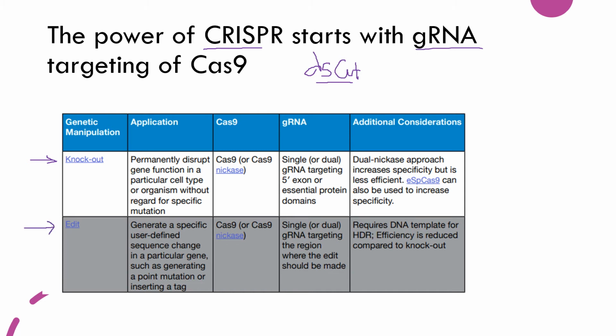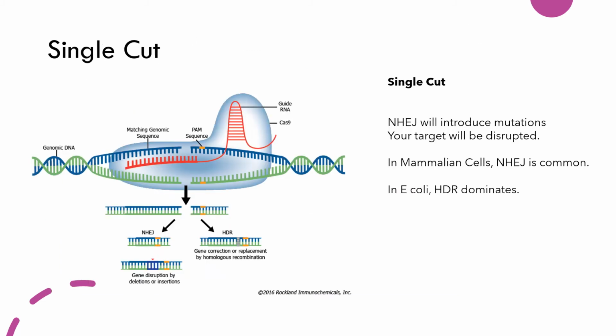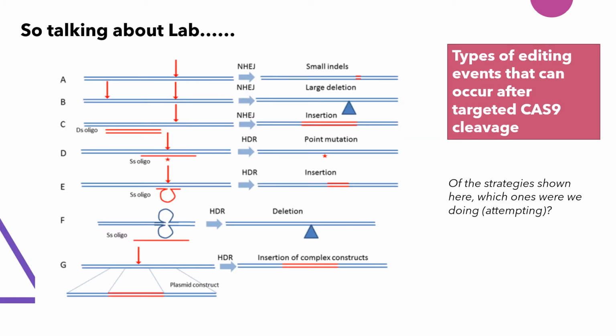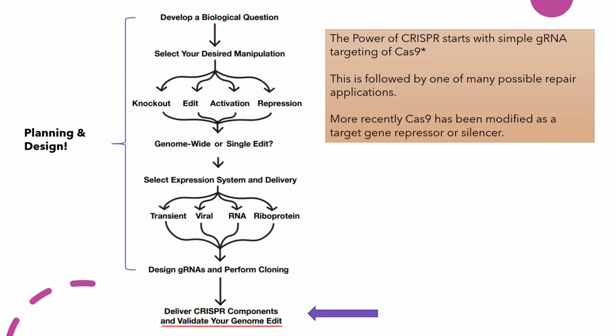When we add the repair template, then we're saying, okay, not only are you cutting here, we want the edited product to look how I planned it. I skipped this while I talked, and I'm going to skip it now. It's just another look at the setup and the alignment. I'm going to get to what we did in lab.